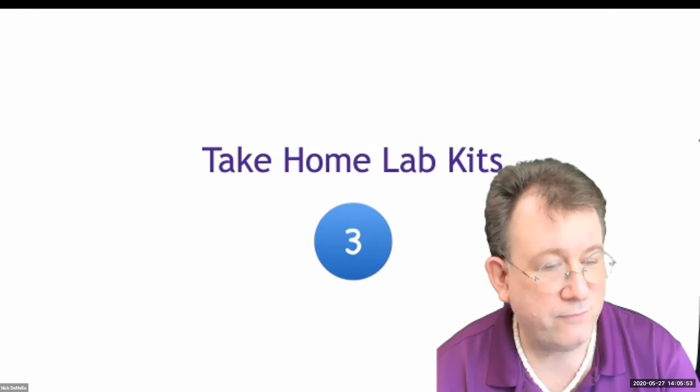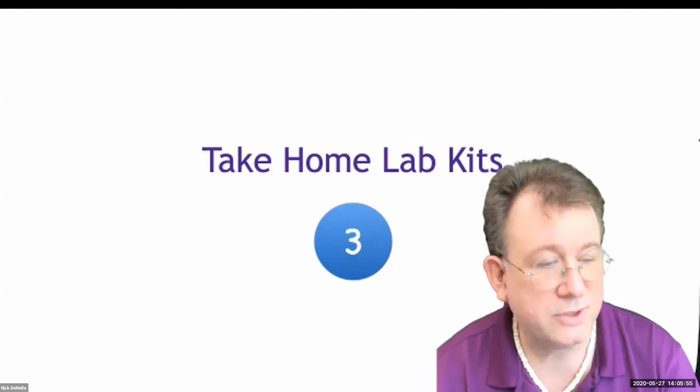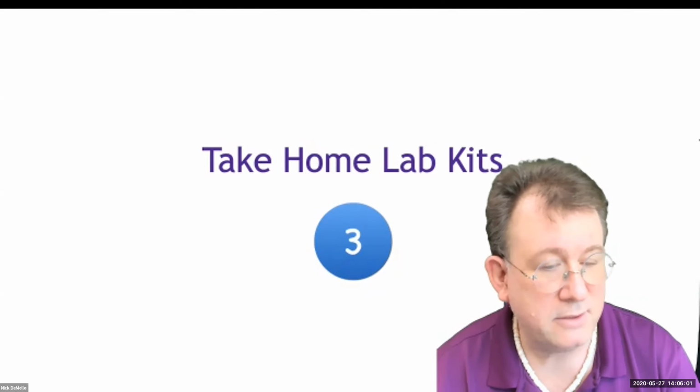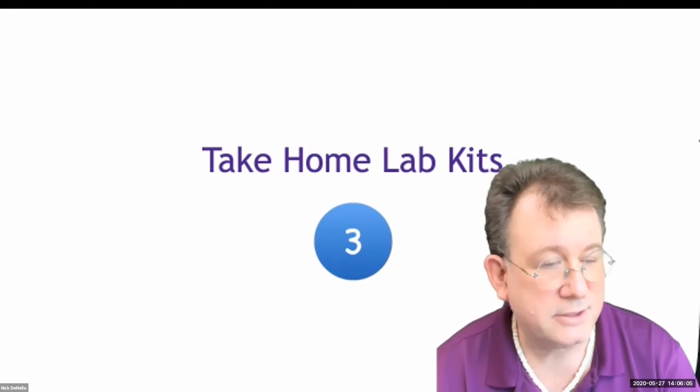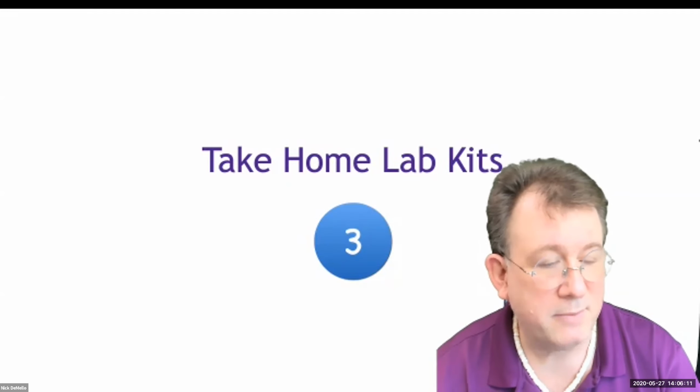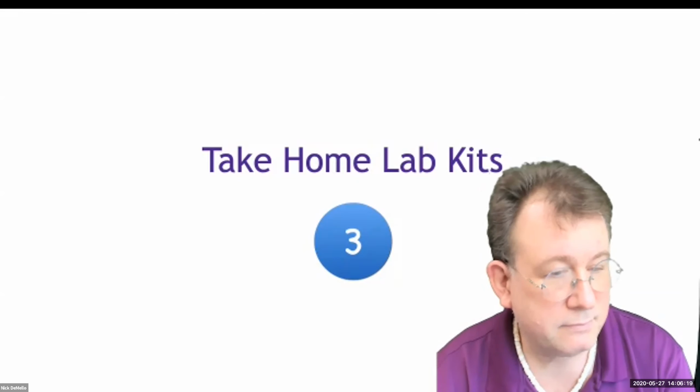However, for take-home kits, for kits where students are putting together things on their own, I strongly encourage thinking about the materials and using relatively simple materials so that you minimize any potential risk. Also, microscale or small scale experiments really takes out a lot of the more dangerous aspects you run into in a full-blown university chemistry lab.